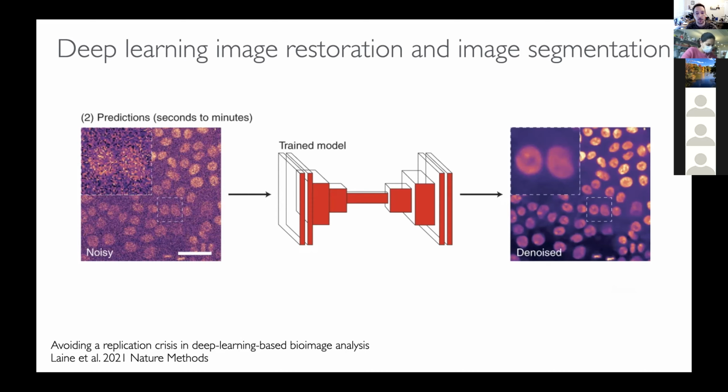And so why you might want to use deep learning over machine learning like Ilastik is, one, to deal with this noise problem. If you're at a microscope, maybe you want to spend less time at that microscope just to get through your project faster, or you might be working on something in live cells where phototoxicity and imaging speed become really important if you're trying to follow something that's very dynamic, that's not so fluorescent, and also it could be perturbed if you start to damage the cell.